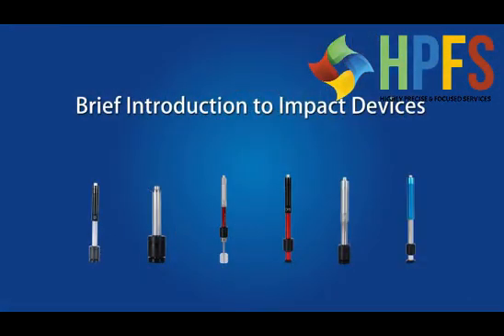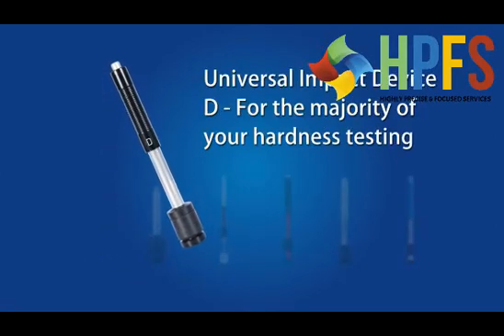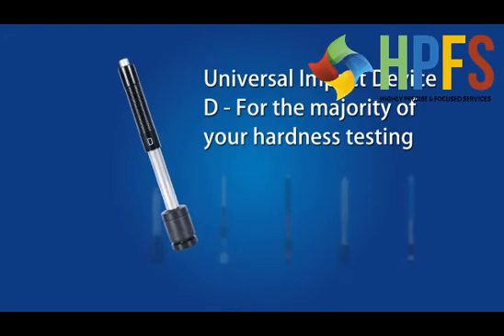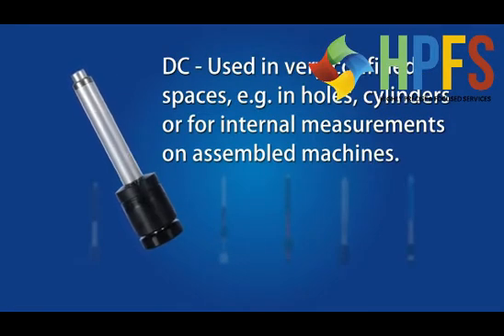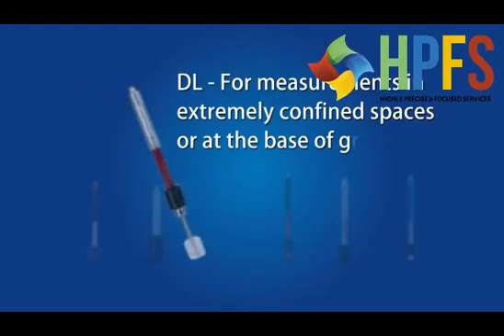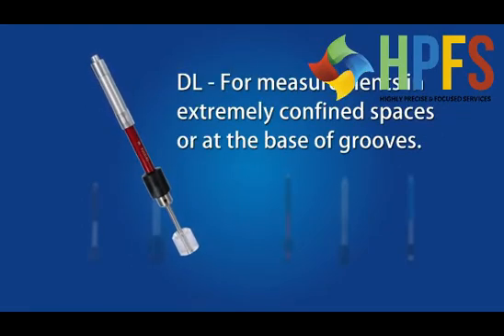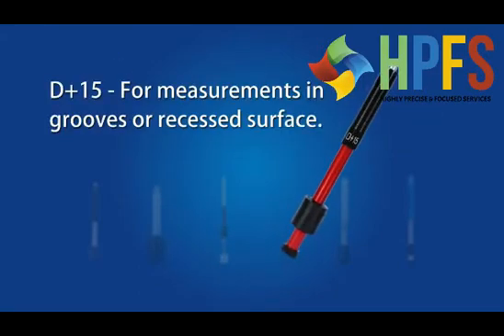Brief introduction to impact devices. Universal Impact Device D, for the majority of your hardness testing requirements. DC, used in very confined spaces, for example, in holes, cylinders, or for internal measurements or assembled machines. DL, for measurements in extremely confined spaces or at the base of grooves.